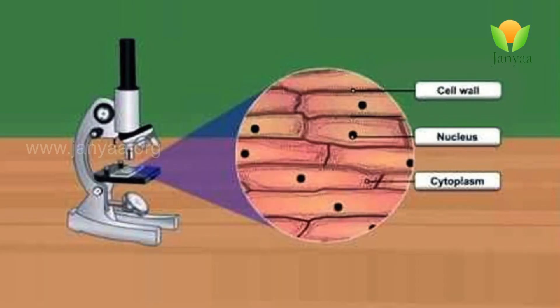What can you observe here? You can observe rectangular-shaped cells which consist of a cell wall and a liquid structure. That liquid structure is called cytoplasm. You can also observe a spherical body at the center of the cell — that is the nucleus. Tell me friends, is it a plant cell or an animal cell? Yes, it is a plant cell, because it has a cell wall. A cell which has a cell wall is considered a plant cell. Thank you.